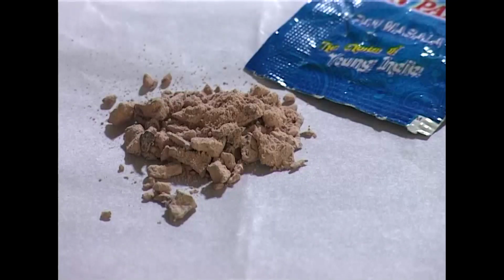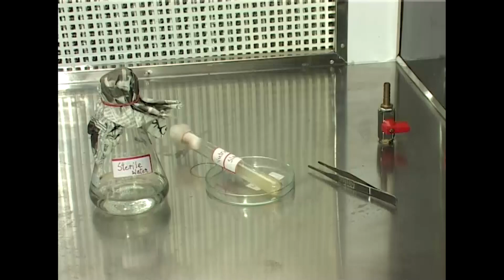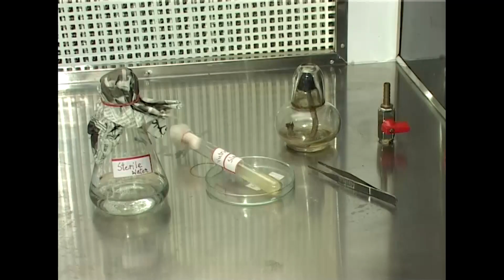From the previous part of the lecture, it is known that the pan masala is contaminated by water and surface contamination. So you have to isolate the natural microflora, normal microflora, from betel nut as well as moistened areca nut, which is marketed as pan masala. The materials required include pan masala, nutrient slant, forceps, sterile water, LAF, spirit lamp. LAF means laminar flow. Very good.